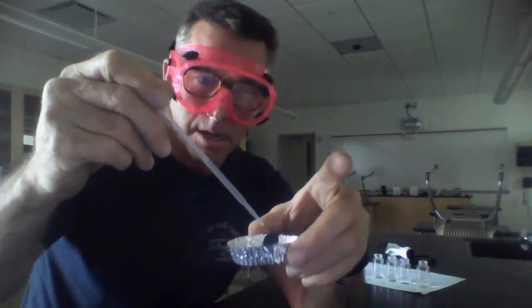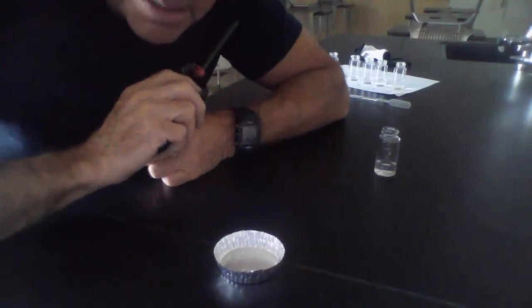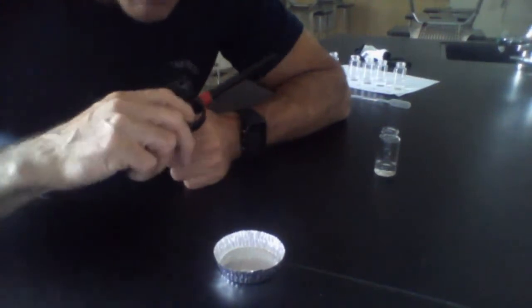Now, I'm going to start with water, which you might understand is a waste of time. But let's do it anyhow. So here I am putting 5 drops of water in. 1, 2, 3, 4, 5. One thing I notice, I don't know if this will pick it up, but wow, does that bead up when I actually put it there. Can you see the sample in there as it drifts across? You know, let me practice this and I'll do it again. Okay, that's about the best I can make the sample show up, which really isn't that well, so I'll just describe it as we go.